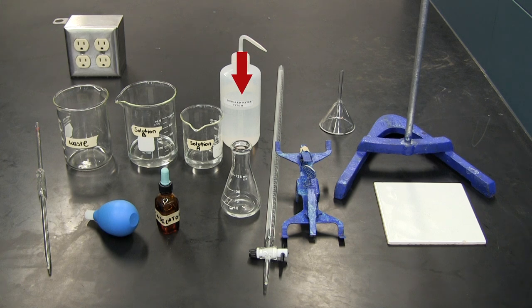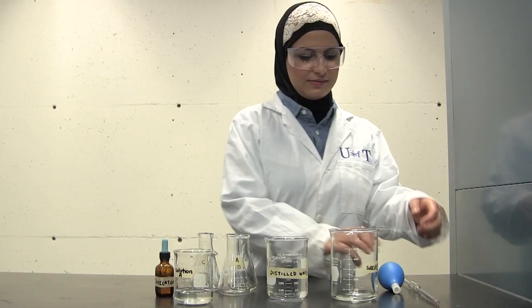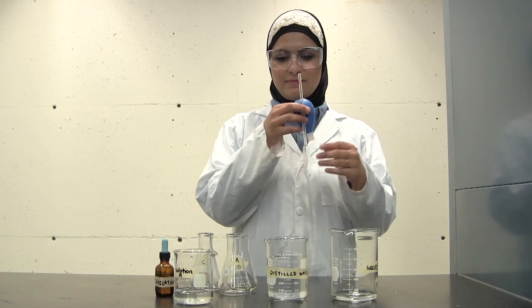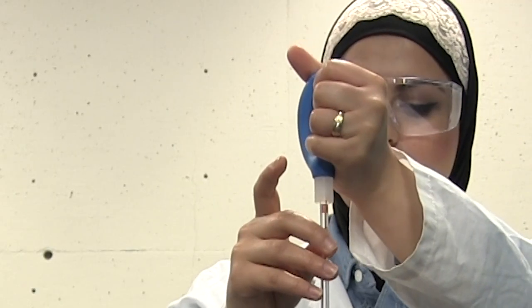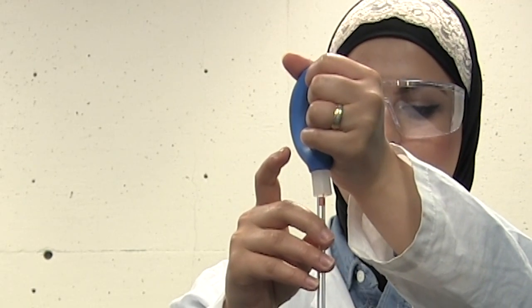Now obtain three Erlenmeyer flasks and label them appropriately. Obtain a pipette bulb, squeeze out all the air, then place it on top of the appropriate grade A pipette. Ensure that there is good contact between the pipette and the pipette bulb. Do not force the pipette bulb onto the pipette — any size pipette would fit in these blue bulbs.